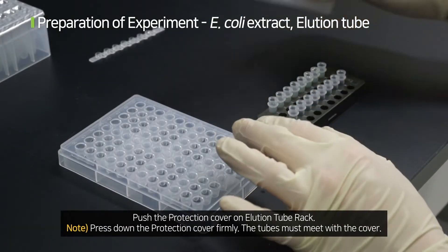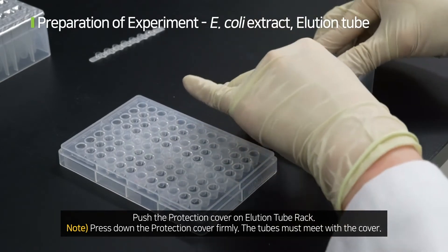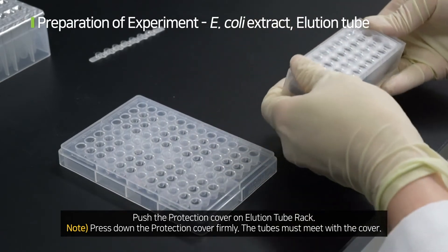Push the protection cover onto the elution tube rack and press it down firmly. The tubes must meet with the cover.